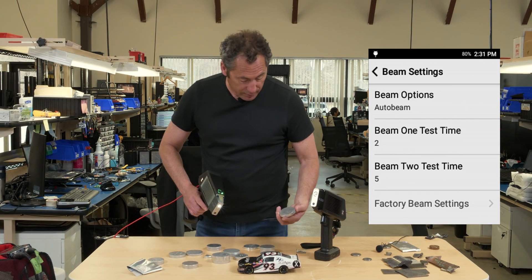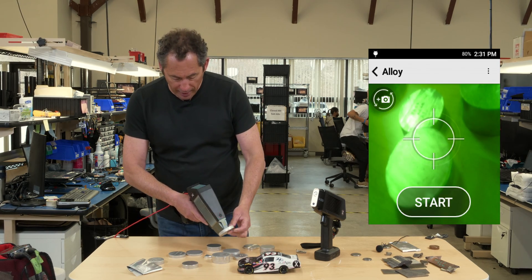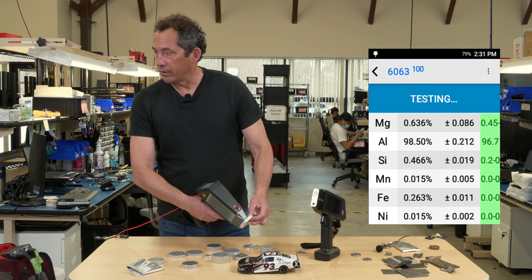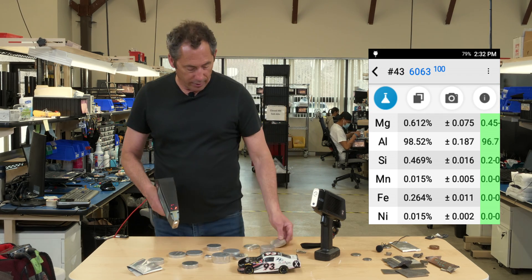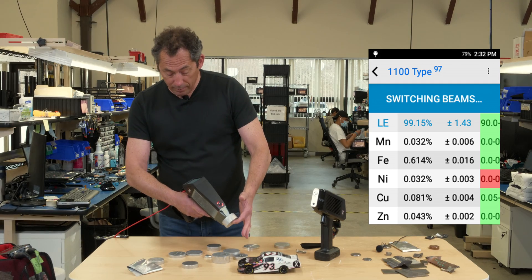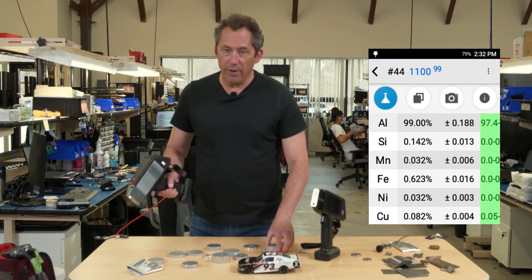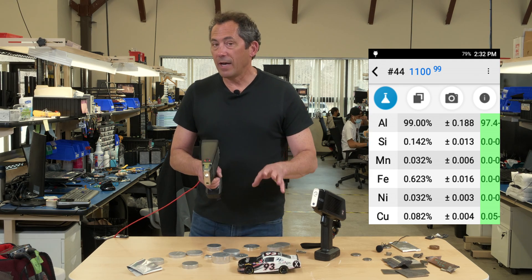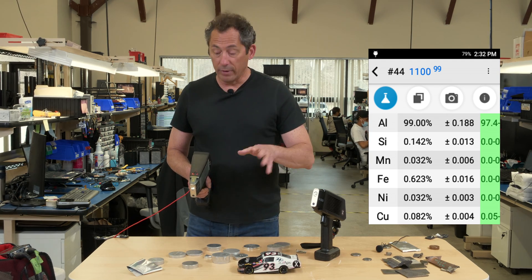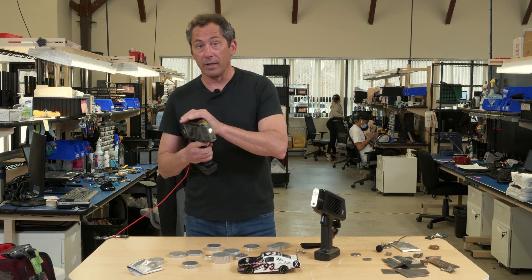We put a lot of time and effort into making that measurement fast — as fast as stainless and high temps, nickels, things like that. So now you can sort a wider variety of aluminums in maybe five or six seconds instead of 30 or 60. For example, going back to the 6063: when I shoot it again, it says 6063 type, but when it flips over to that second beam, in a few more seconds you're measuring that 0.6% magnesium — now you know for sure it's 6063. If I shoot the 1100, same thing — when it flips over, you don't measure any magnesium, so it confirms it's a 1100. That's something we really invented and we're really proud of. We sell a lot of x-ray guns for aluminum testing because it's so much faster.